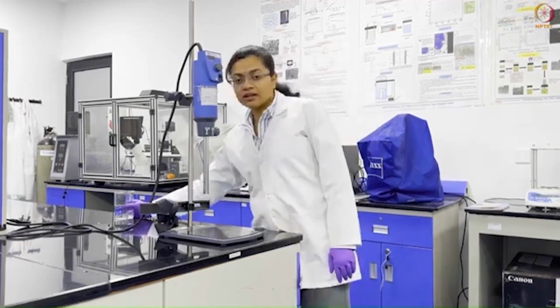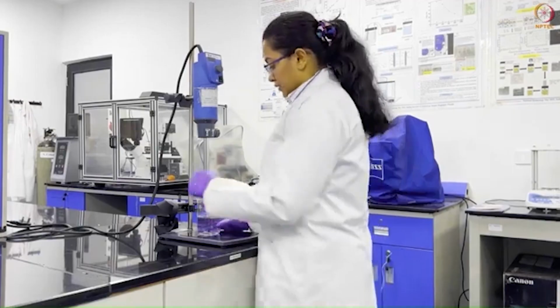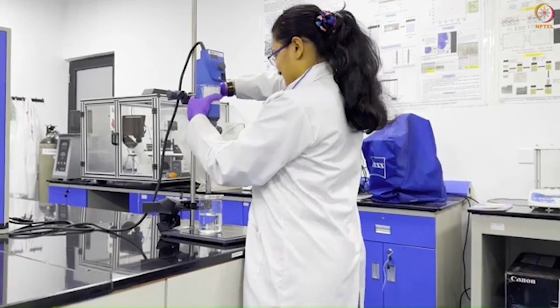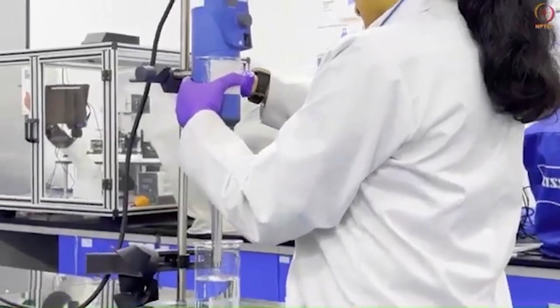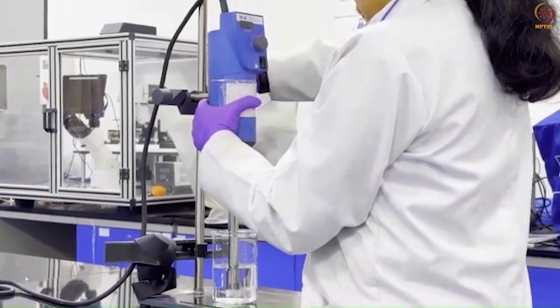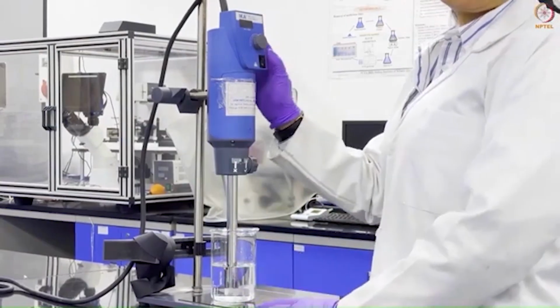So here I have taken some amount of water in a beaker. Now I'll put this inside the sample holder. From here I'll detach the homogenizer and lower it in the water, and now I'll switch it on.